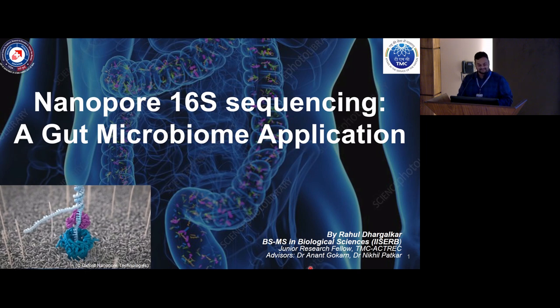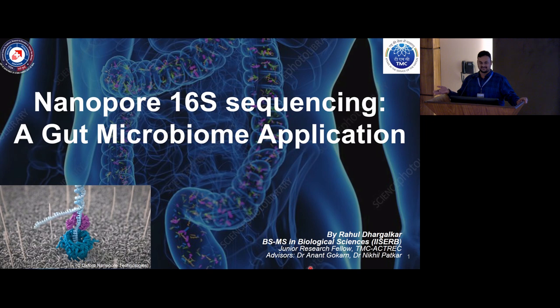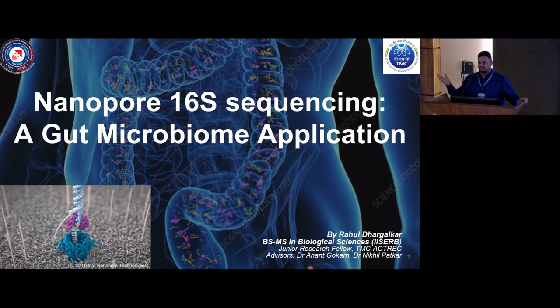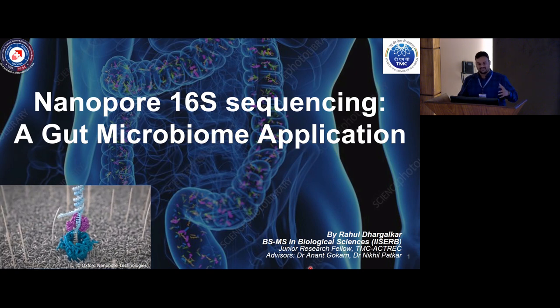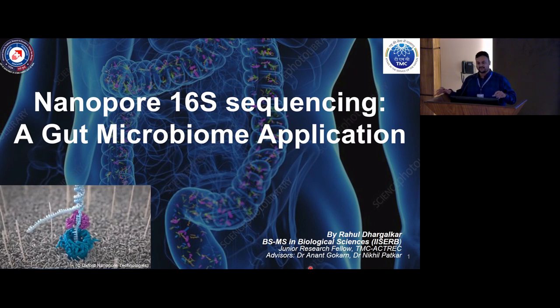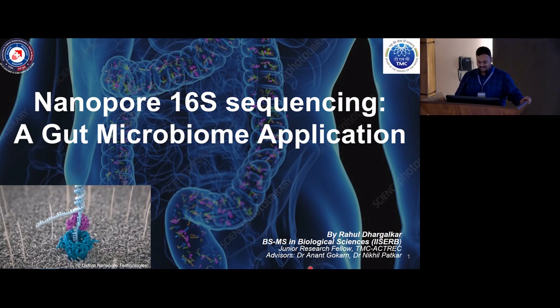All right. Most of the heavy work has been done already by the previous speakers, especially Dr. Gaurav, Dr. Swapnali, Dr. Shruti, and even previous days' talks. So they kind of do most of the heavy work for me. So I'll just quickly jump onto one of the applications of Oxford Nanopore, specifically for the gut microbiome.